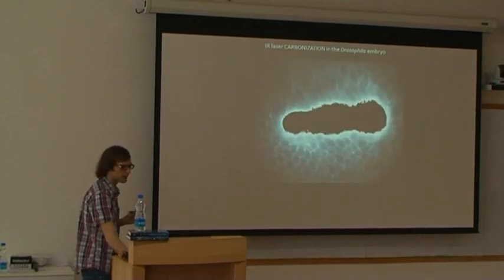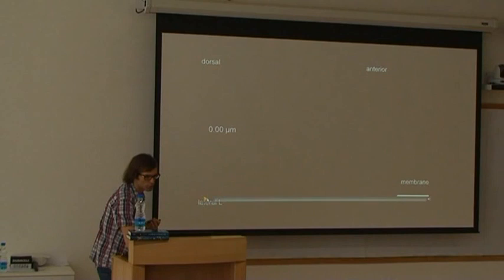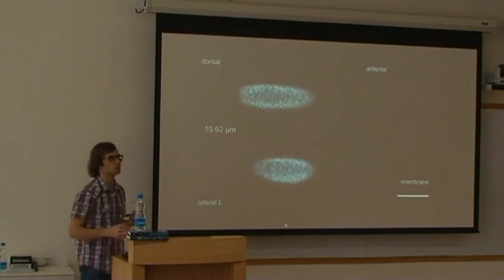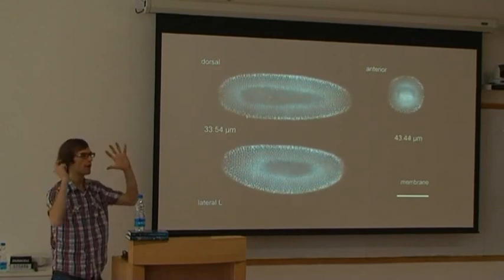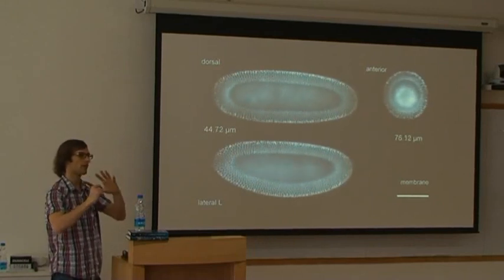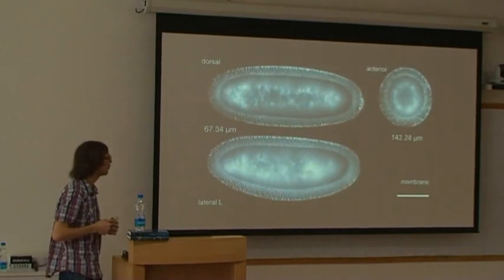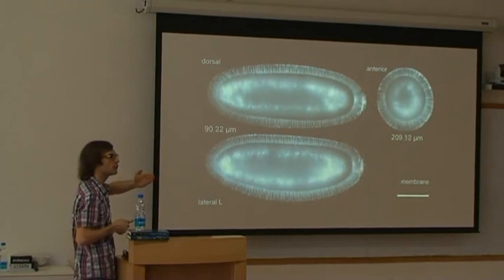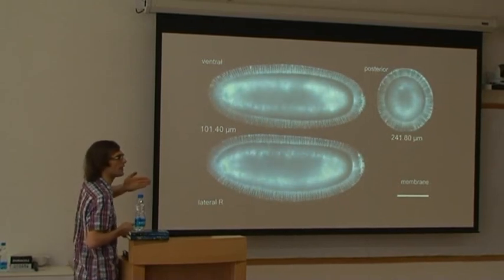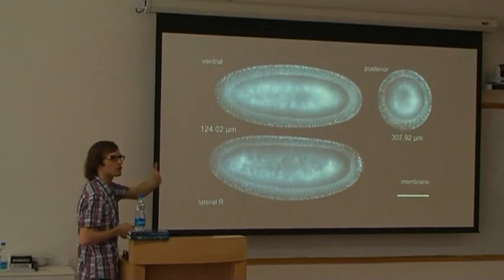As I was saying, I'm doing this kind of study at the embryo level. And this is the kind of imaging that I'm doing right now, using a SPIM, a light sheet microscope, which allows visualizing the full embryo in 7 seconds. And after that, you can do a time lapse. This way you have a visualization of the whole embryo. What is interesting about these images, as I'm going in Z, is that you will see good quality on one side, but also on the other side, while normally with a confocal, the image is degraded as you go in.